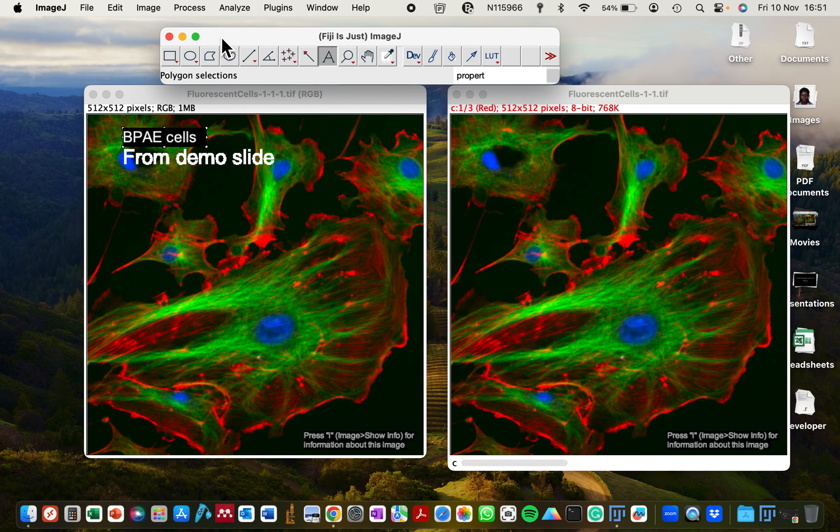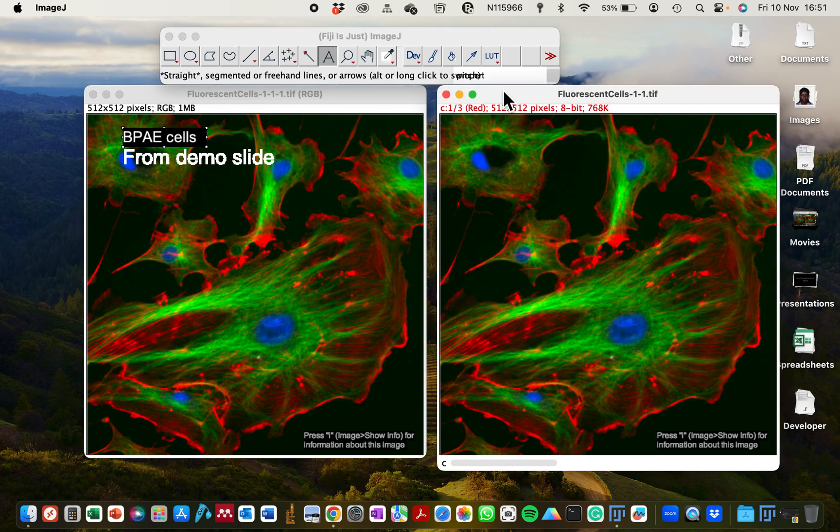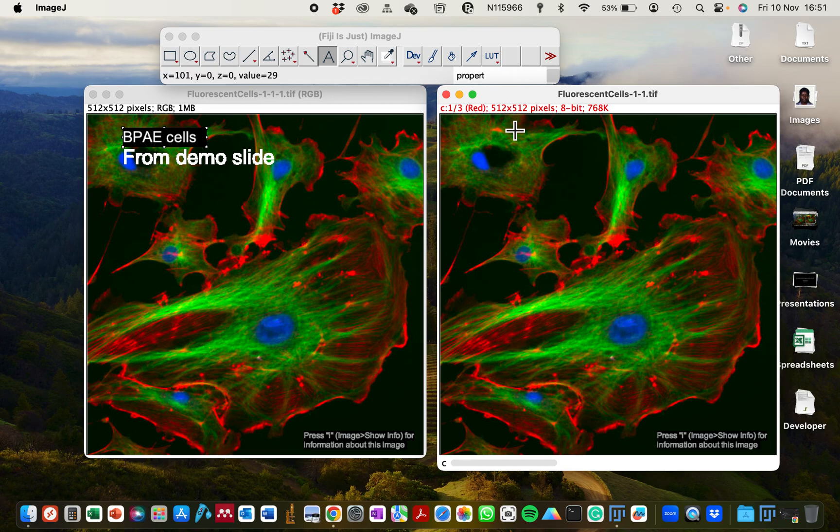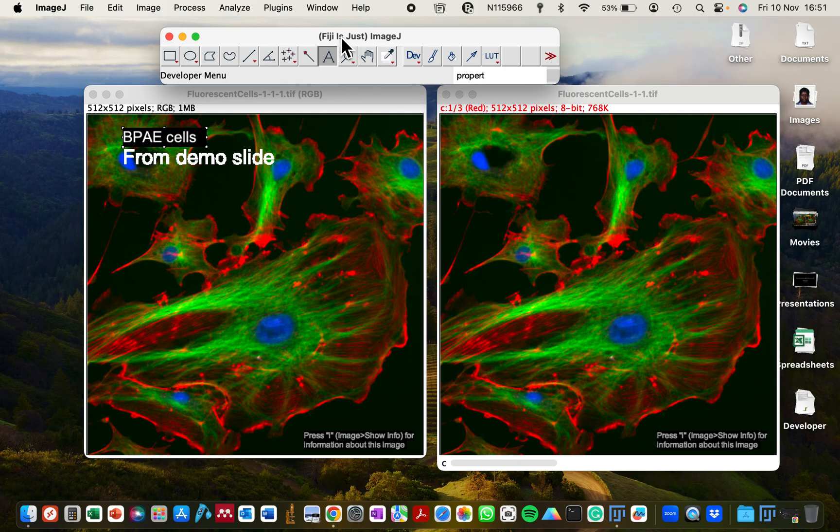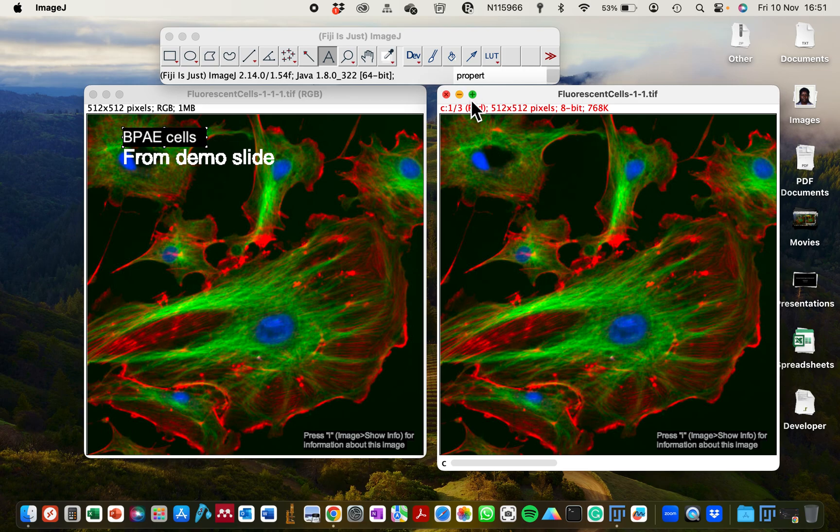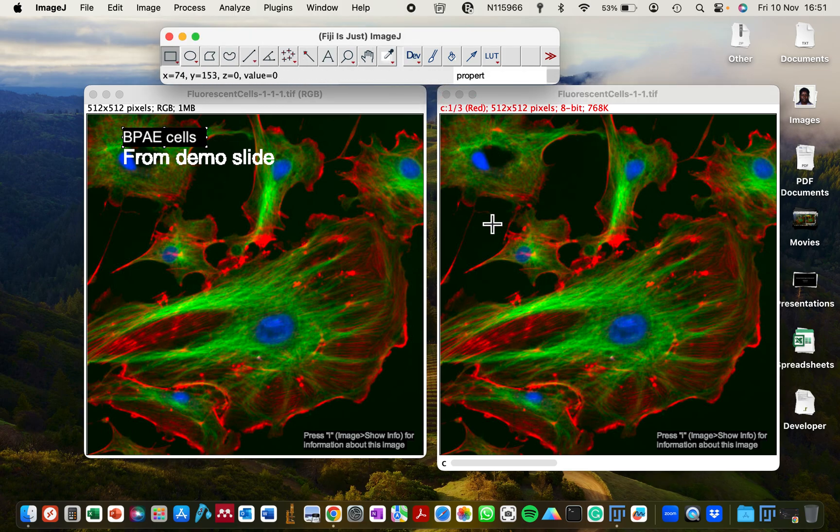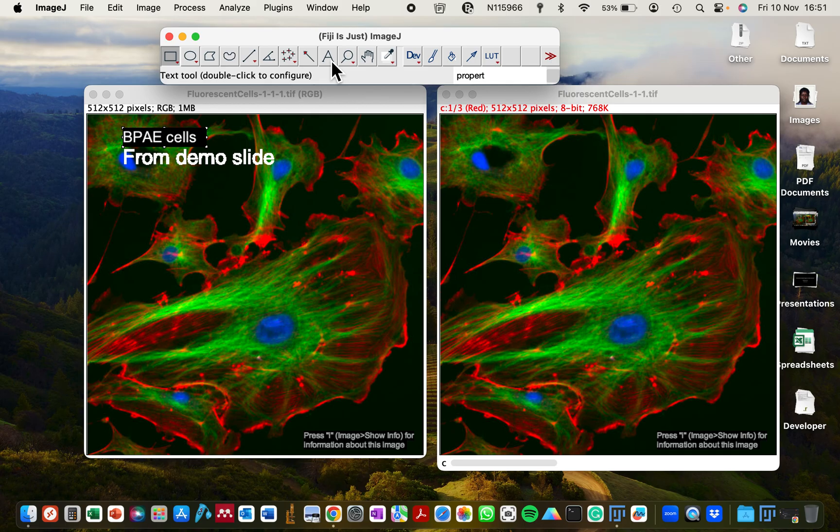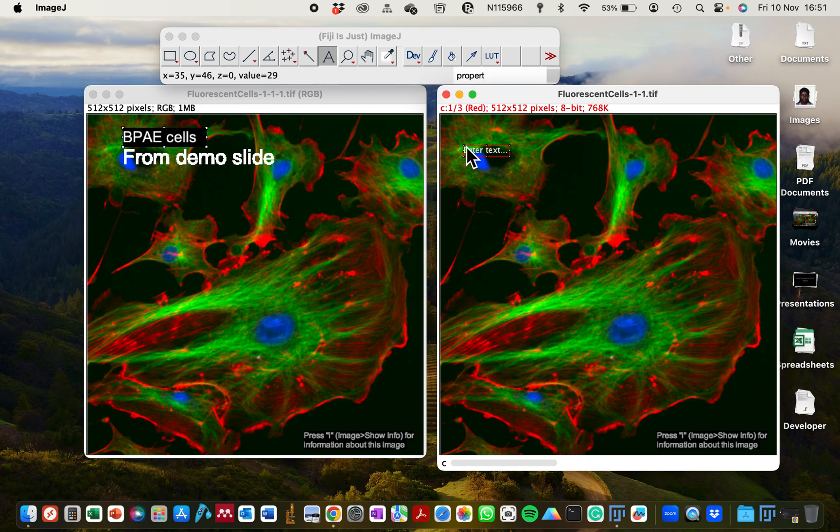When you have your image open in ImageJ, you can either drag the image to the window bar that will open the image, or you go from File and click Open. That will also open the image. And then in order for you to add text to the image, there is this alphabet symbol which represents the text tool icon. If you click on it, you can then place that on the image.